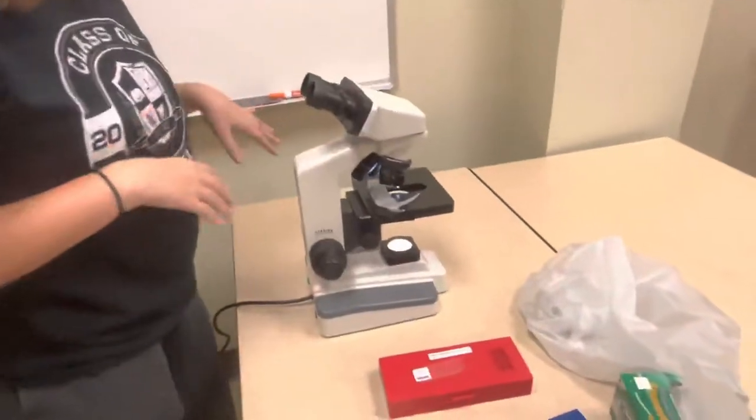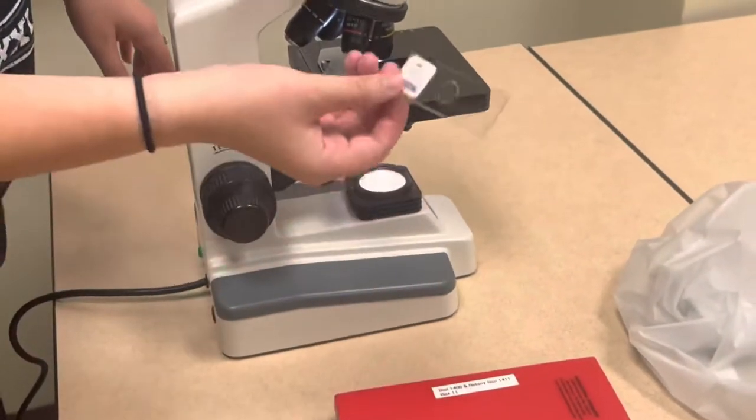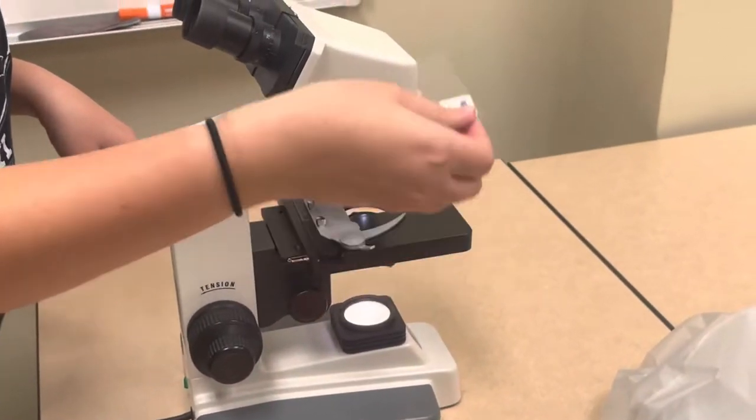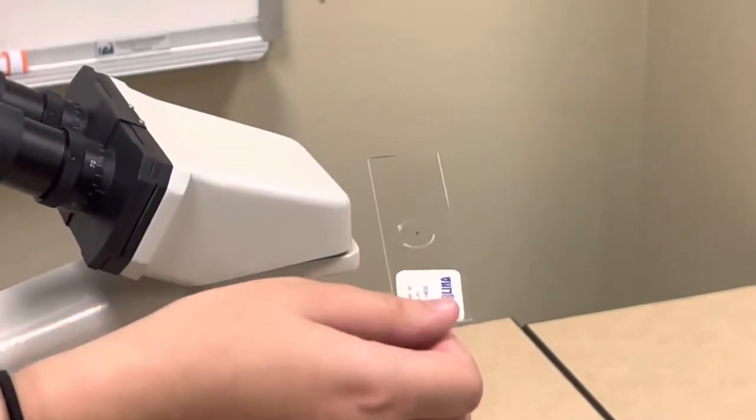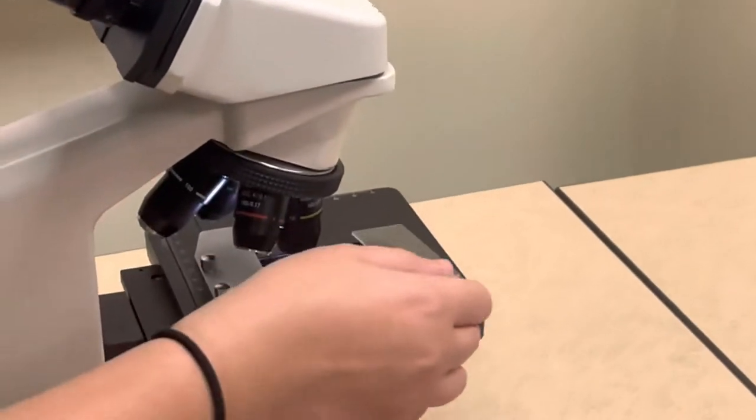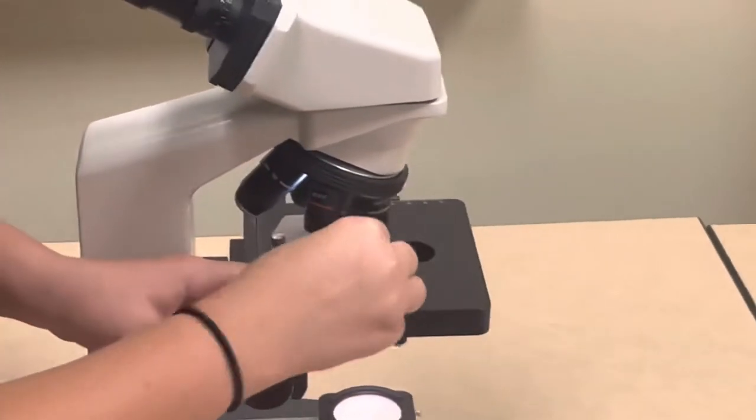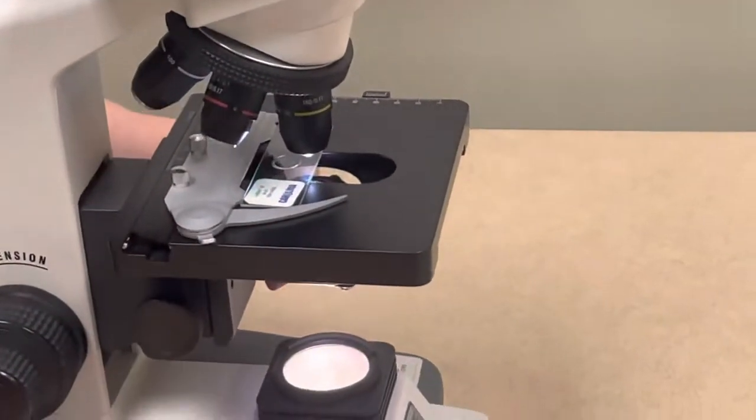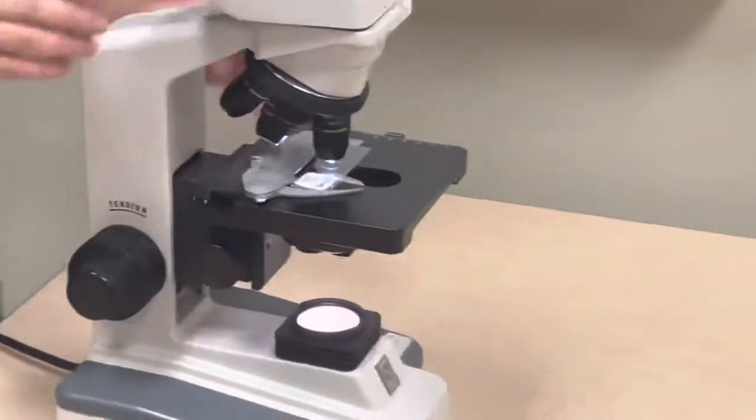Now when you're going to be starting, you're going to take the letter E slide. You're gonna want it facing away from you. So the sticker should be faced like this. And you're going to go ahead and slide it in.